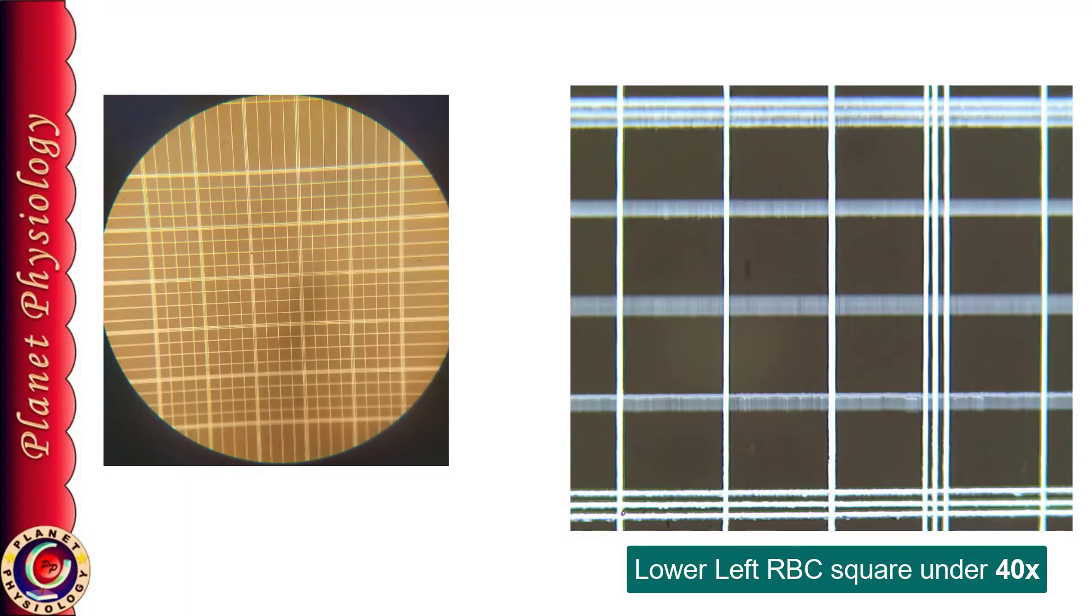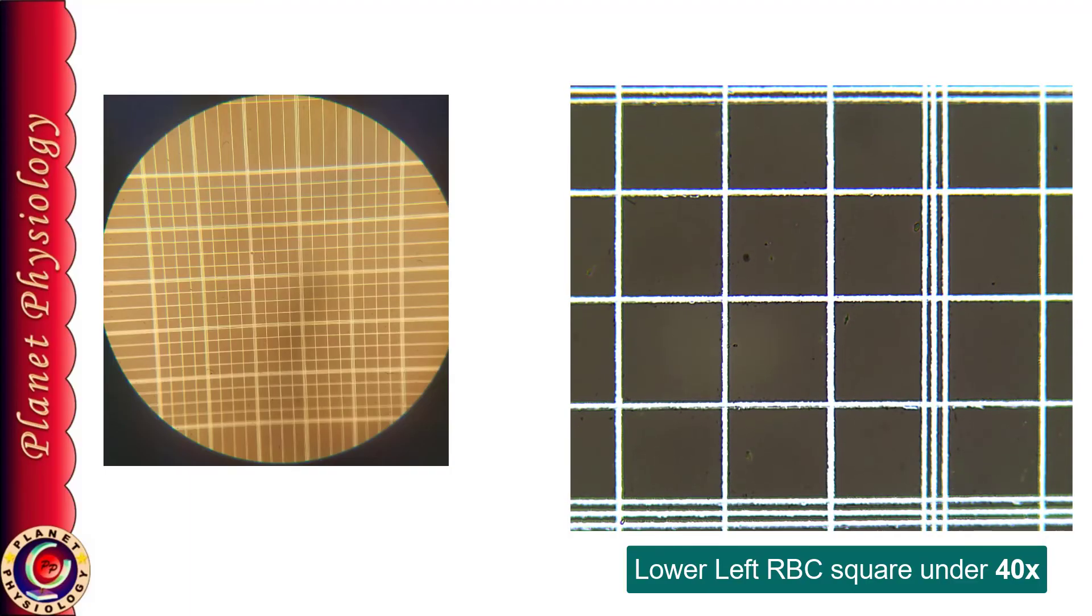So while moving just count the squares, 5th square is your corner square. So I am moving upwards.